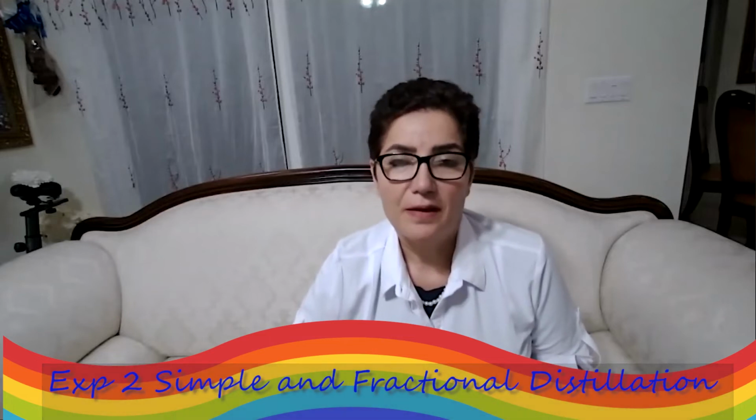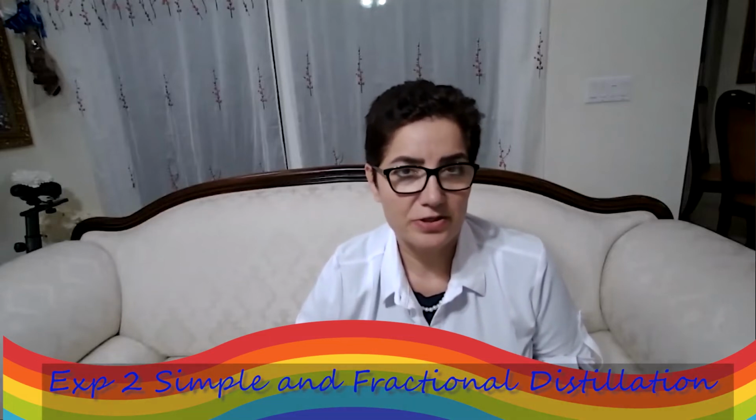Distillation. We're going to practice simple distillation and fractional distillation. As the pre-lab discussions, I will talk about the advantages, disadvantages, and when you would use simple versus fractional distillation. We'll talk about some of the points that you have to follow for setting up the distillation apparatus and the difference between the simple and fractional setup.